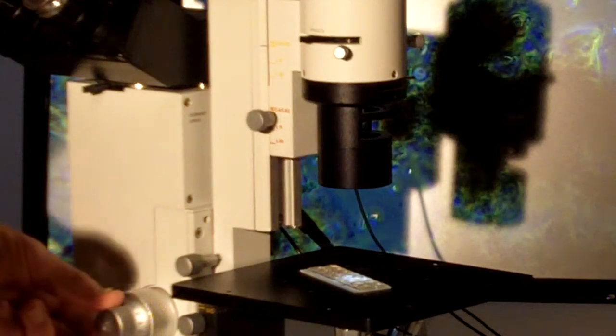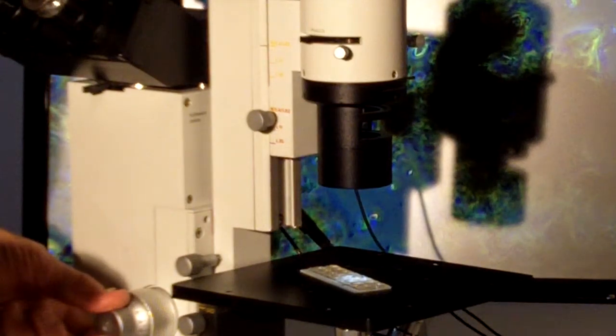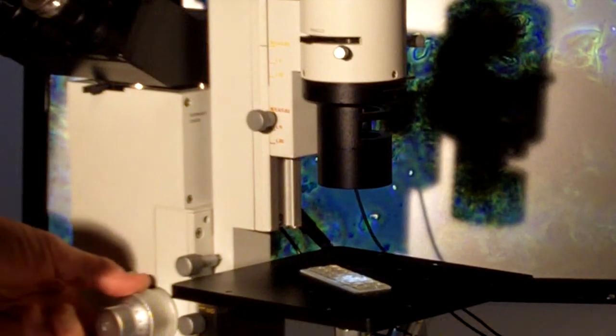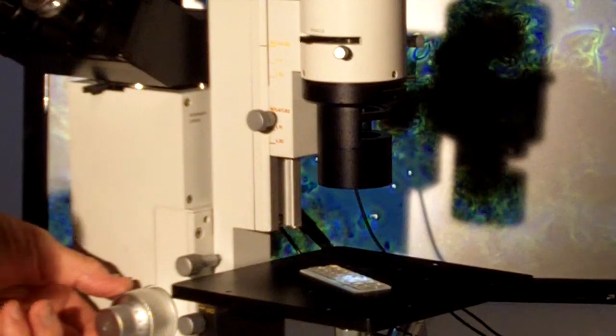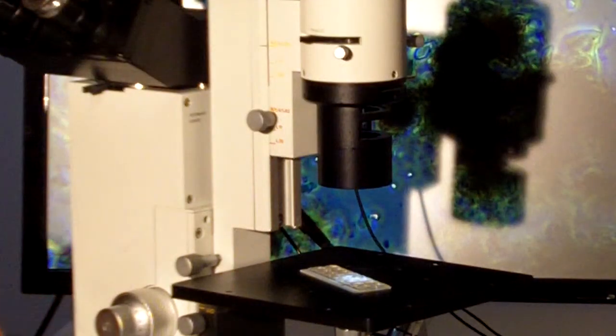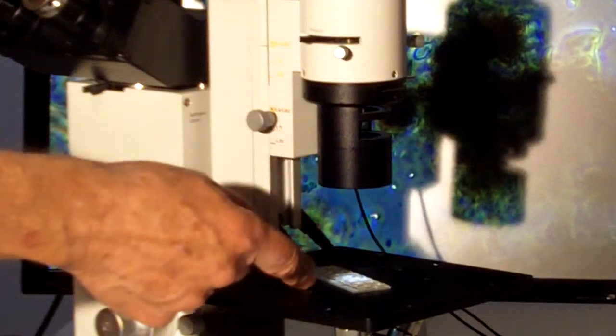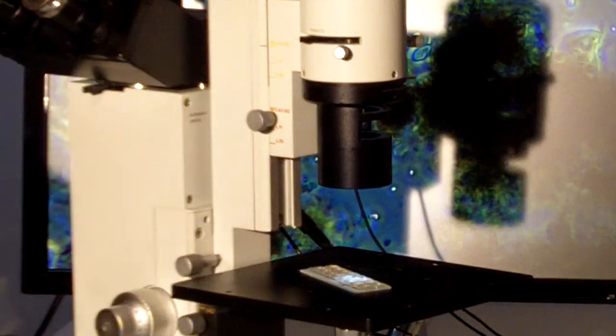Phase contrast allows us to see detail and contrast in unstained fresh living material. And of course the optics are down below here so whatever we can fit in between this 60 millimeter distance, such as petri dishes, small flasks or chambers of your own design, can easily be added.